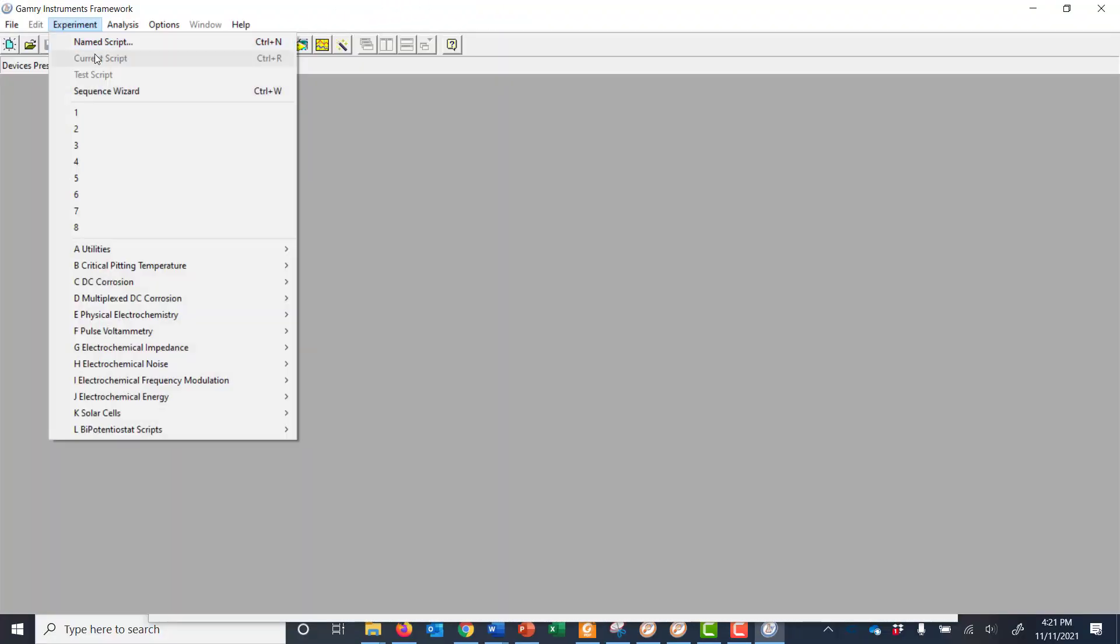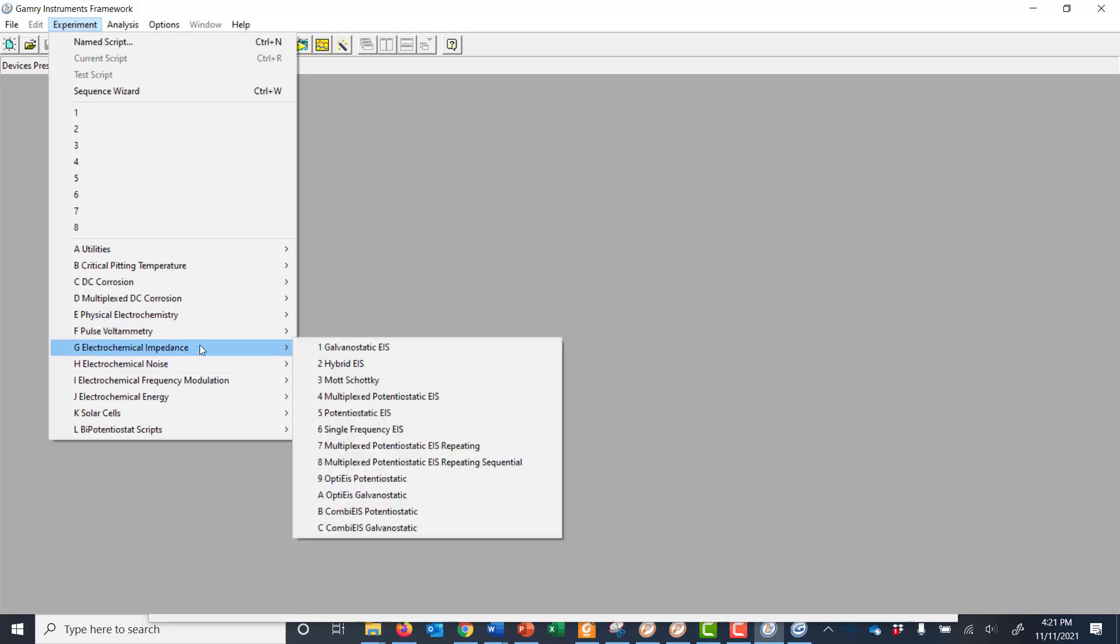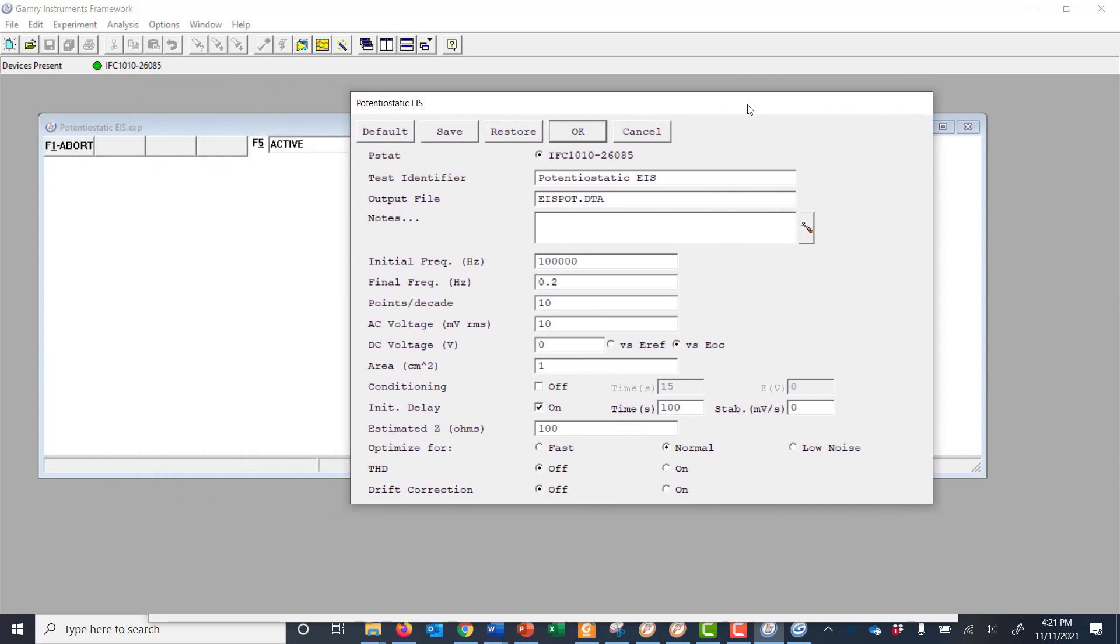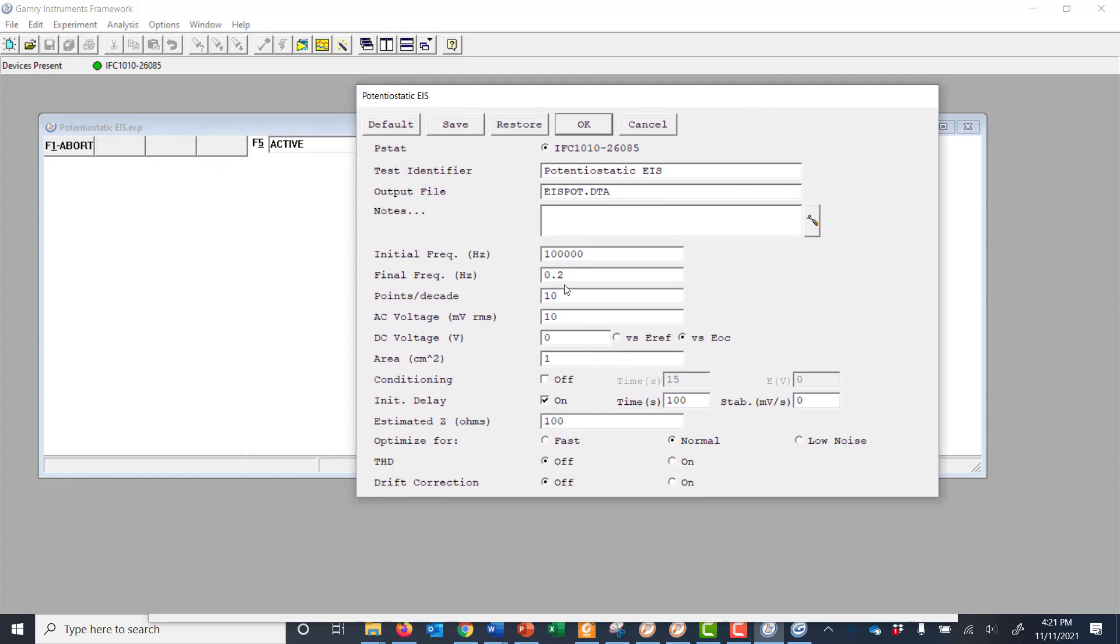And in terms of what this looks like for data acquisition, this is very simple. We would choose to run, say, potentiostatic EIS, loads up our data acquisition script, and we would input the parameters that we typically might want for our experiment. And then down here, we have the option to turn on our total harmonic distortion measurement. So this will turn on the measurement. We'll also see in another slide or two about drift correction. And so if you wanted to run drift correction at the same time, if you knew your cell voltage was going to be drifting, you can turn this on at the same time. And we click OK and run your experiment.